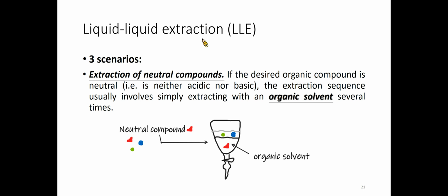Based on the analyte and the solvents used, LLE can be performed in three scenarios. The first one is the extraction of neutral compounds. In this case, our analyte prefers to stay in organic solvent. We can extract the neutral compound by applying an organic solvent several times.